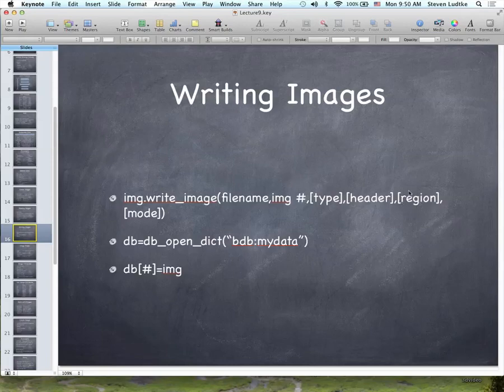So this region reading and writing is very convenient if you, as I say, have one of these large files. There's a field called cellular tomography, which involves doing three-dimensional reconstructions of cells or sections of cells. And this is done both by cryo-EM. It's also done by X-ray tomography. So there are a number of sites around the world now which have X-ray tomography capabilities. You can look at whole live cells at resolutions approaching 100 nanometers or something like that, or 50 nanometers.